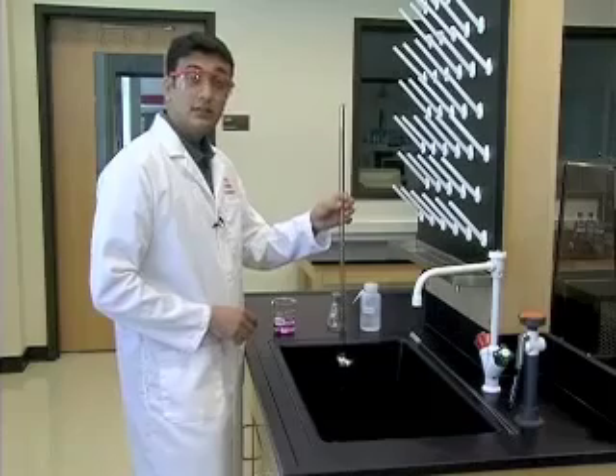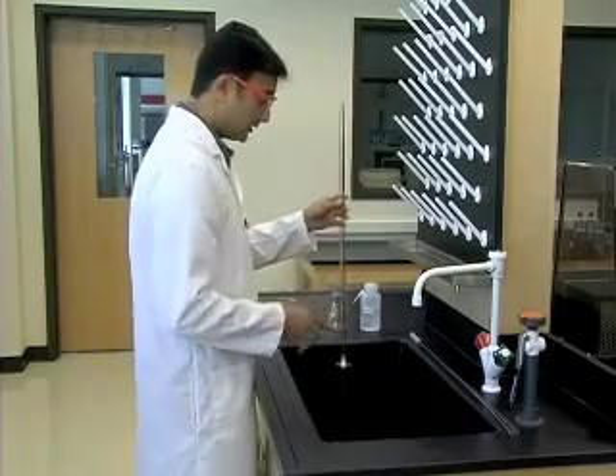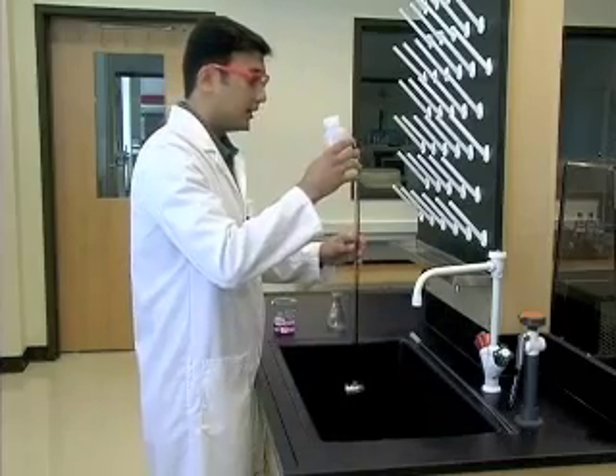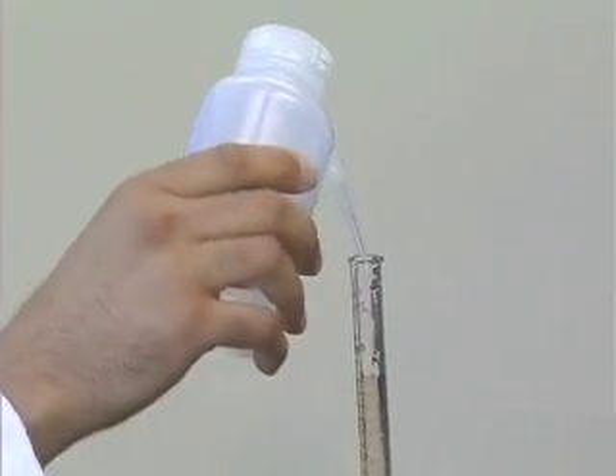Now we are ready to clean the buret. To do this, we're going to stand by the sink, use the deionized water, and pour a few milliliters inside the buret.